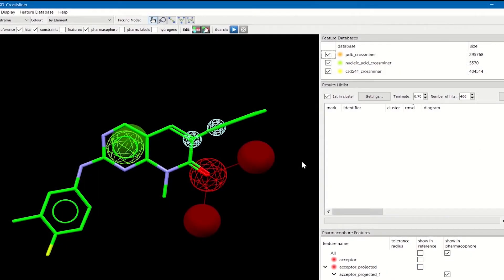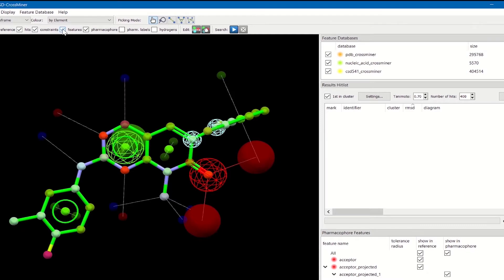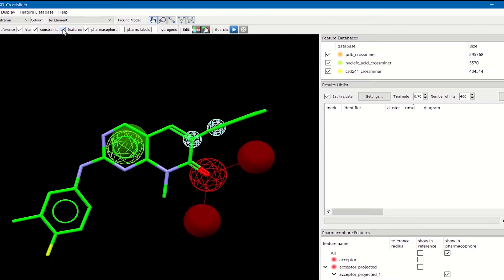This is the CSD CrossMiner GUI. You can see that it is divided in two parts. On the left side we have a 3D view where the molecule-like structure, the pharmacophore and also the features are displayed. On the right side we have an explorer window that is composed by three different windows.